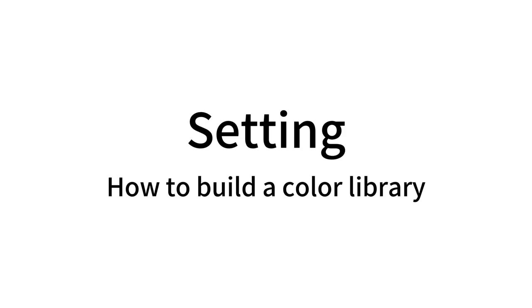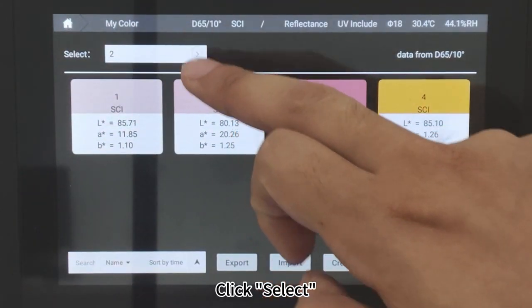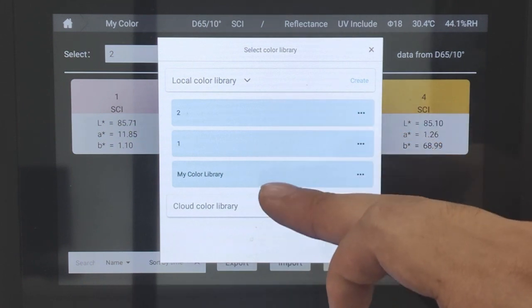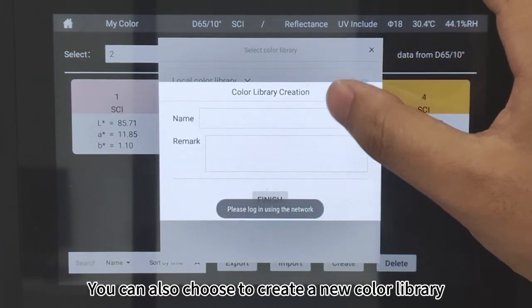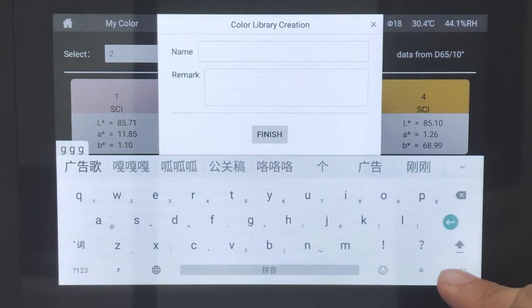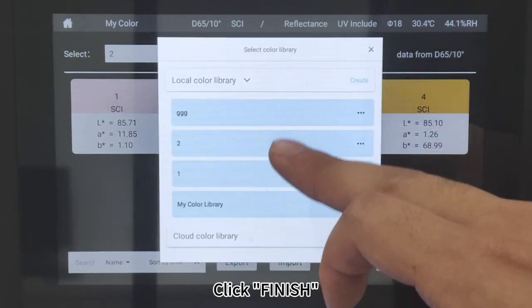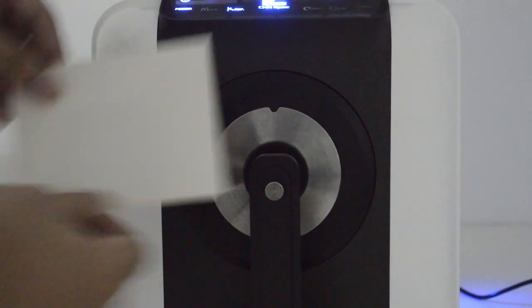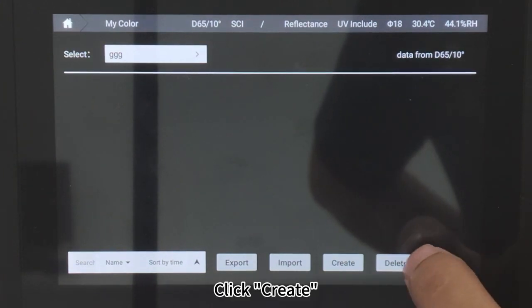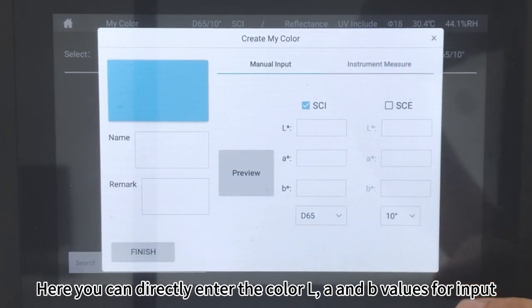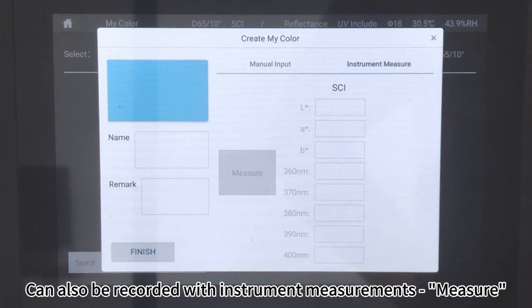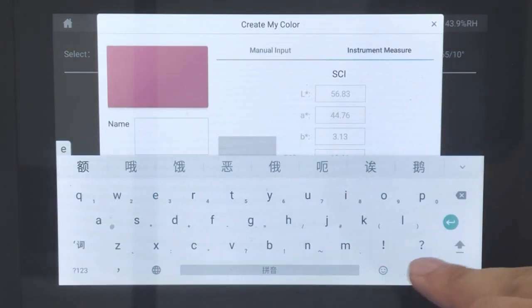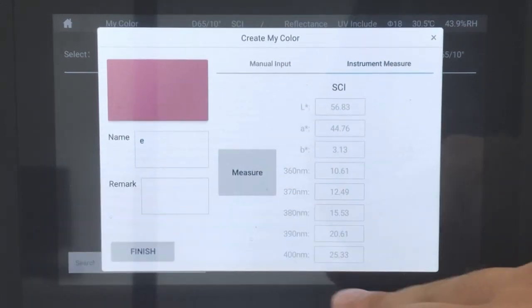How to build a color library: Click on My Color, then click Select. You can add to the original color library or choose to create a new color library. Click Finish. Take the color you want to add and place it at the reflection measuring port. Click Create. You can directly enter the color L, A, and B values for input, or click Instrument Measurements to record with instrument measurement. After measurement, the color can be named. Click Finish.